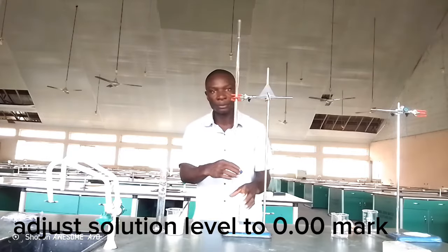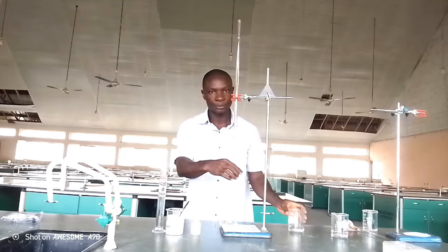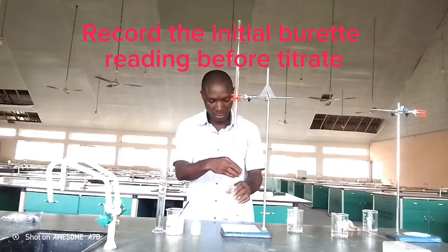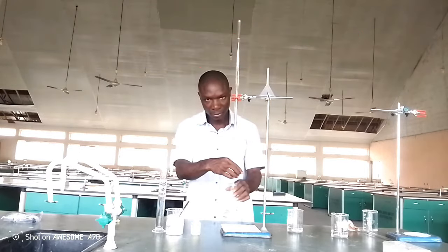Adjust the solution level to the 0.00 mark. 8. Titrate the clear mixture to pale pink. Record the initial burette reading before titrating.